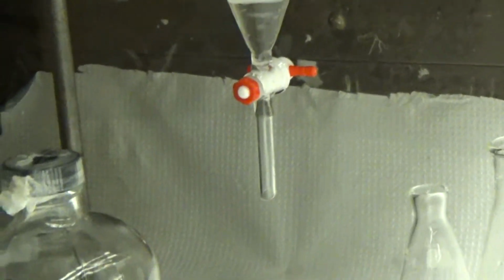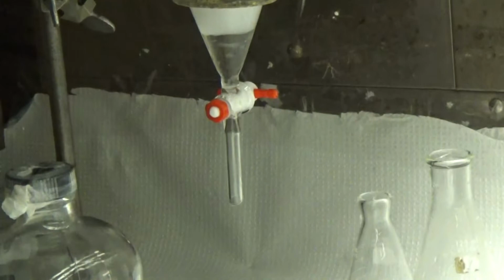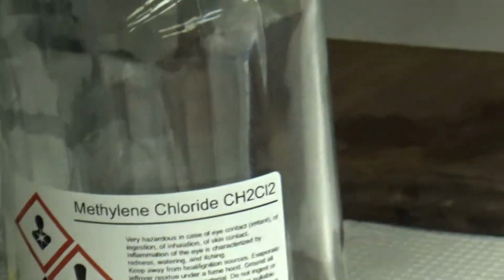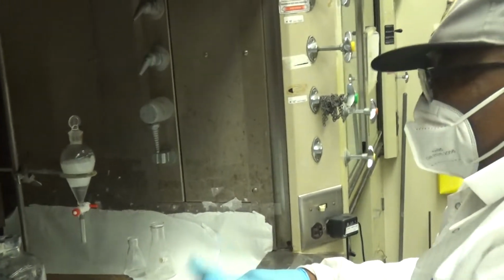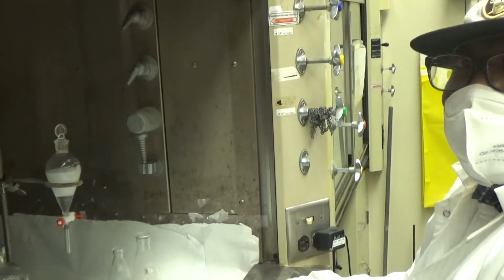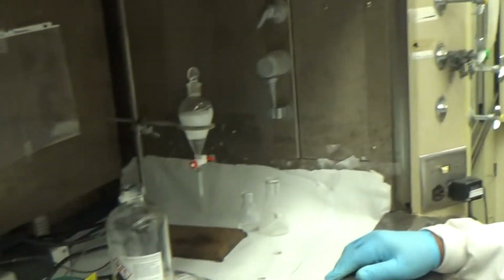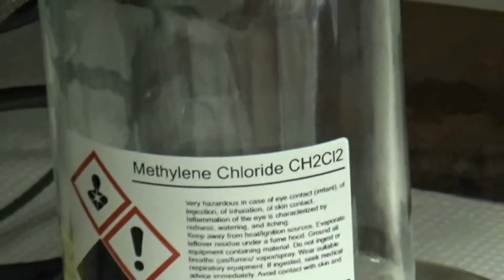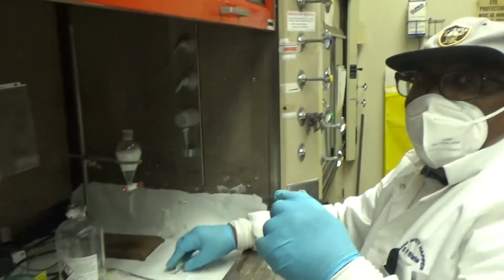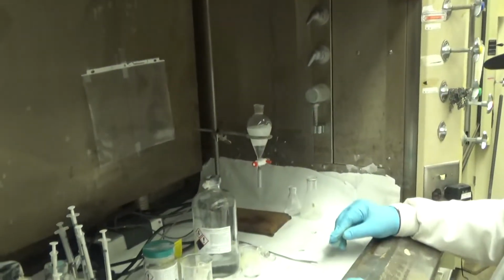Do you know any solvents where the organic layer is less dense? We know methylene chloride is more dense, but we have an experiment coming up where it could be the opposite. I think the general rule is if it's chlorinated, it's always on the bottom, and if it's not chlorinated, it's almost always on the top. So like ether, hexane, ethyl acetate with water, those are on the top. Yeah, it's a good general rule.